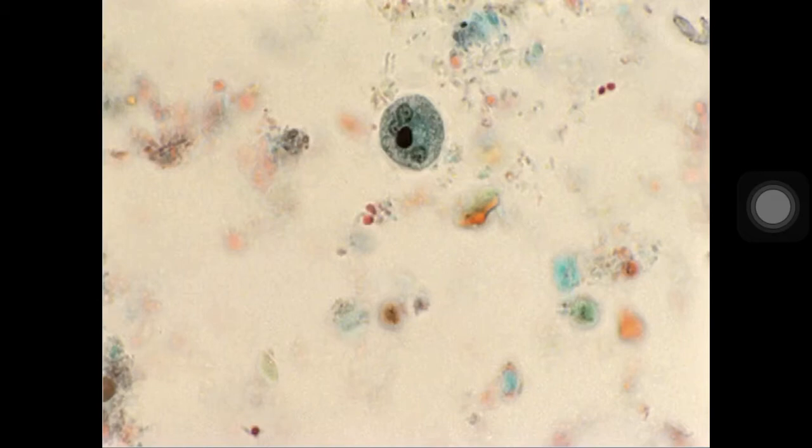Okay? Alam po ba kung ano? Medyo mahirap, no? To differentiate, lalo na sa mga protozoans and especially to your amoeba, no? So mukha rin po talaga siyang Entamoeba histolytica, no? But siguro what can help you, no, is our additional information, and I think naman po, no, if they will give such pictures or cases, dapat they should give additional information para makatulong sa atin, no.